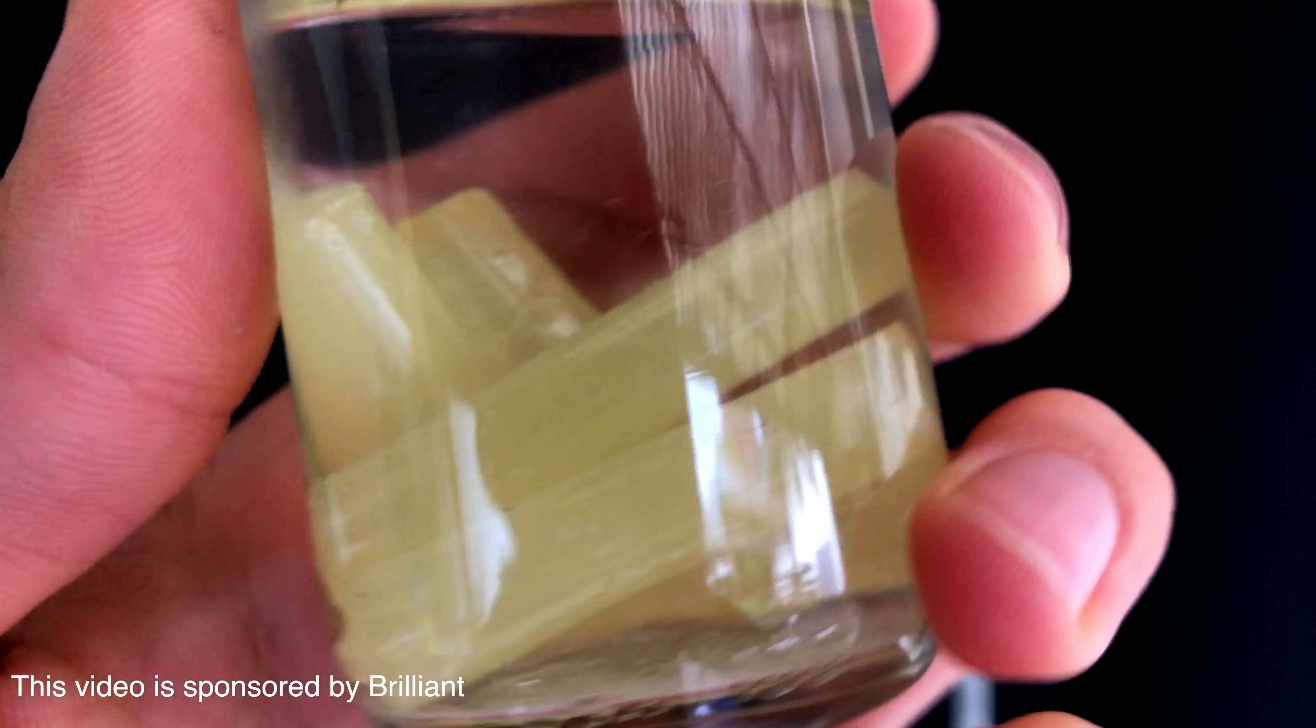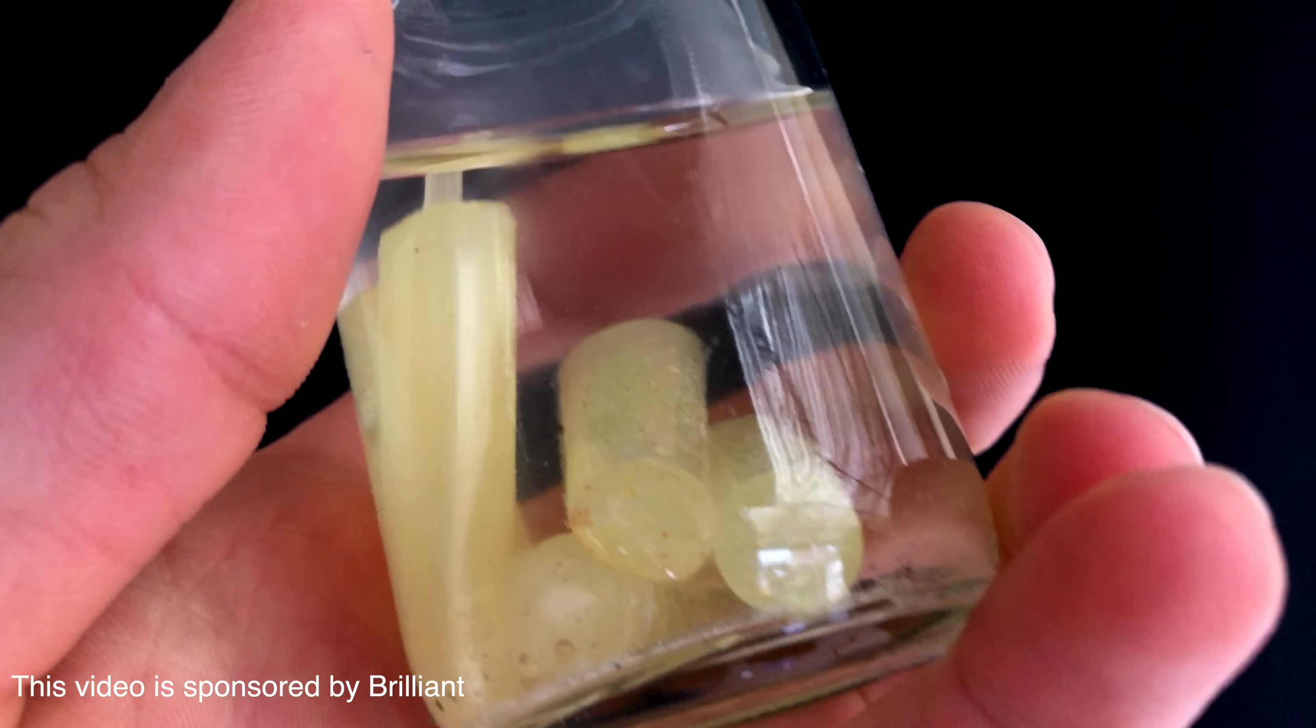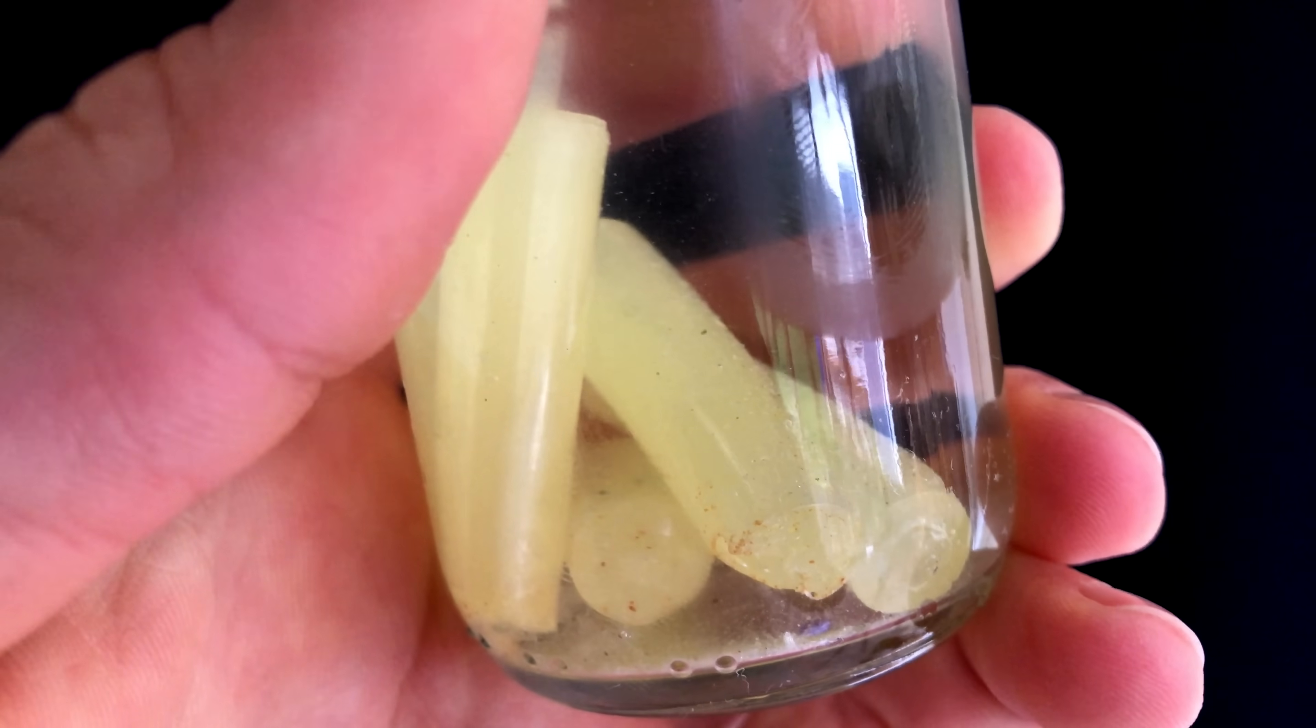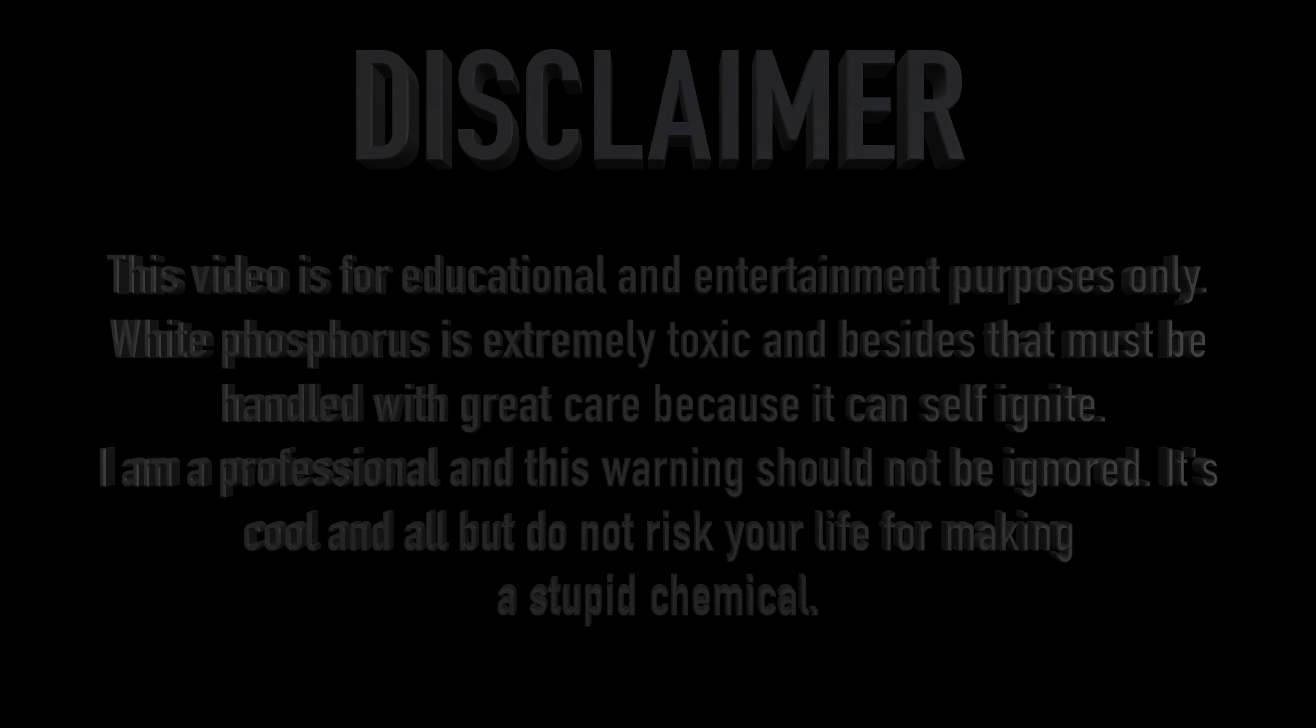Today I am going to show you how to make this crazy element, which glows in the dark when exposed to air, likes to light on fire all on its own and besides that is exceedingly toxic.